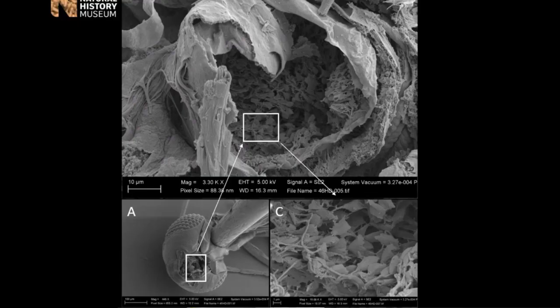We weren't able to actually visualize the parasites themselves because they're so small. Our technique had a resolution of 0.9 microns, the one that we generally used anyhow. But we did scanning electron microscopy, and you can see on this infected fly here, we're looking into the pharynx, and sure enough, you can see these parasites here, which Matt's identified as leptomonad promastigotes.